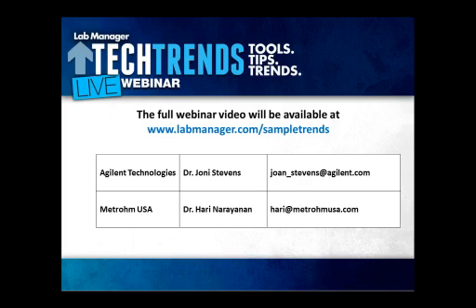All right. Next one. If I have a sample of suture made out of a biodegradable polymer, then which preparation technique would you recommend in order to perform a successful chromatography? And I think the person is thinking in terms of GPC, so gel permeation chromatography. Would that be the ideal choice? If the polymers are of a known molecular weight, or the components of breaking down of the polymer are of distinct molecular weights, then GPC would quite possibly be a good choice. I think GPC would probably be the best choice, and then you could fractionate at that point in time.